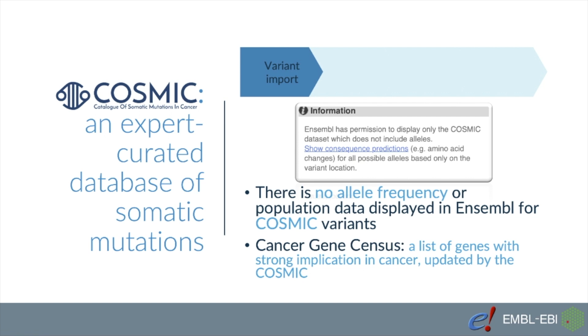As I mentioned before, COSMIC is a curated database of somatic mutations in cancer in human. And one thing to remember is that COSMIC data is not entirely public. What I mean is, you do need to have your own license if you want to fully access their data. And those licenses are free for researchers and academics.